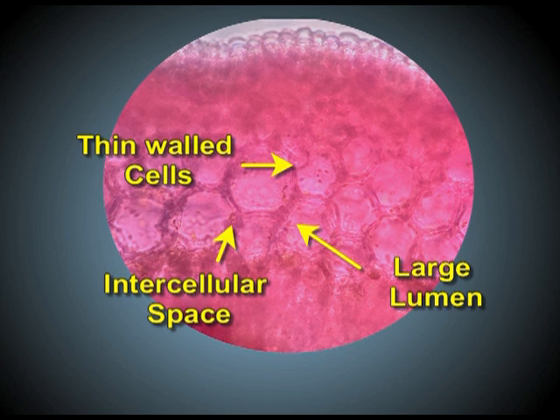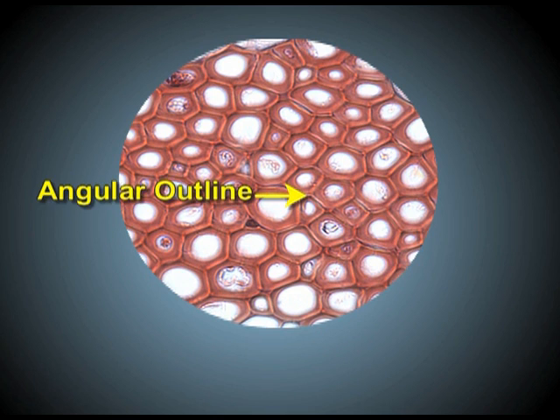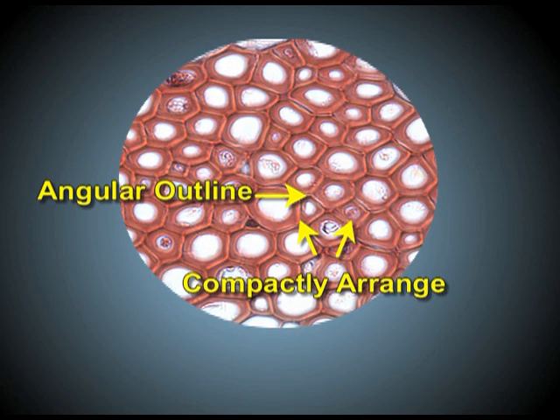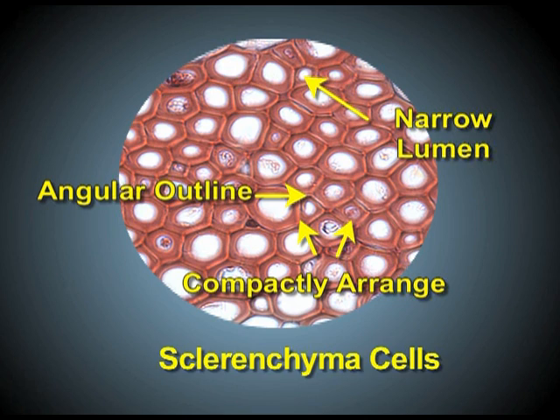Such thin-walled cells are called parenchyma. In contrast to this, we have thick-walled cells as well in the hypodermis, and some cells of the cortex are also thick-walled. These thick-walled cells have angular outline, they are compactly arranged, they do not have intercellular spaces, and they have narrow lumen. Such thick-walled cells with these characteristics are called sclerenchyma.